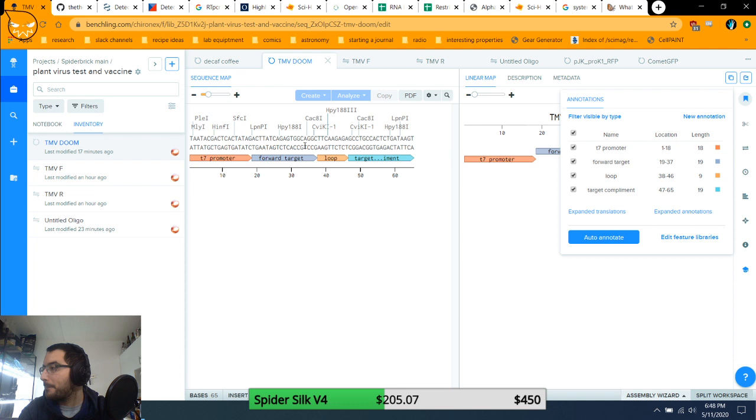No, it's not that I just need uracil, it's that I need all of the individual actual letters. Like, the actual backbone is different, so I can't just use shredded DNA. I actually have to use NTPs.